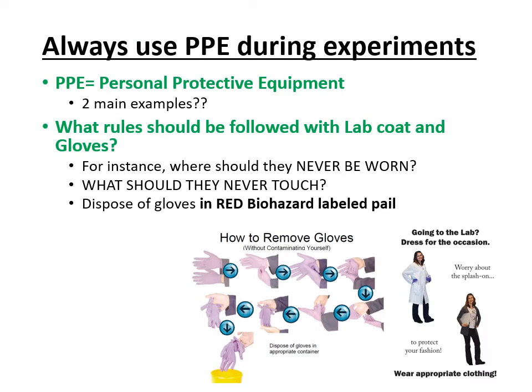Now, one of the terms you have to be familiar with in this class is PPE. Now, thanks to the COVID crisis, a lot of students now are aware of what that means, and a lot of the public know what that means now. So it stands for Personal Protective Equipment.